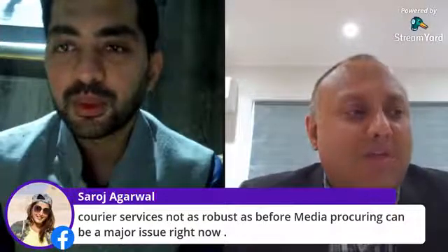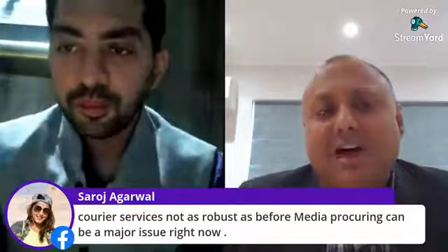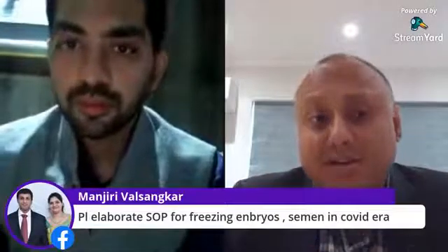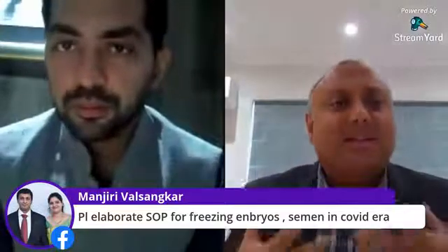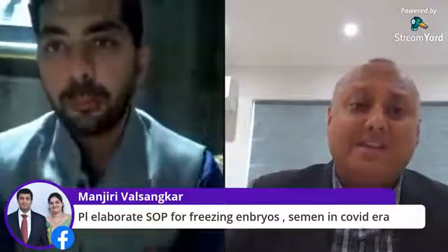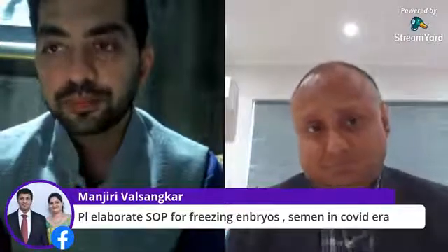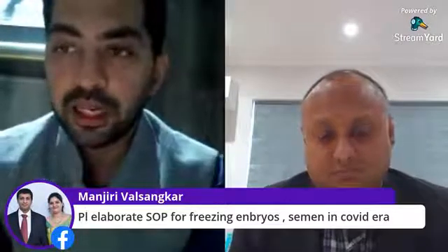I don't know how prevalent class 2 cabinets are in a lot of the labs in India, because I've heard that there's a lot of class 1 cabinets, not necessarily class 2 cabinets where there's a shield in the front which protects the operator. So also bear in mind that if you're working in a class 1 cabinet, this is not necessarily protecting the operator. So when you're working with these native fluids like semen and follicular fluid, you are essentially exposing yourself as well. So these are things that we now have to really watch out for, especially in our scenario.